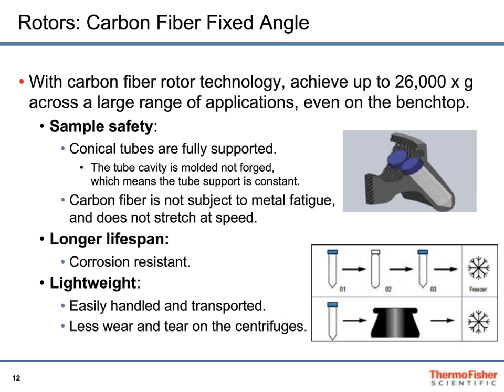Now, here's one specific thing that happened. Once we started replacing metal, engineered metals with carbon fiber, we wanted to take advantage of all those things on the previous slide, but we also realized there might be some things we could do where we could take carbon fiber capability beyond anything you can even expect to do in metal.